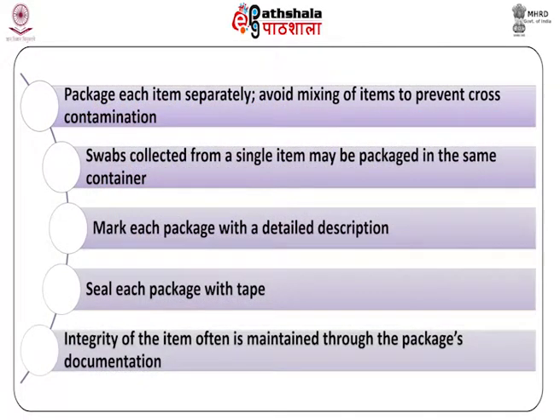Package each item separately. Avoid mixing of items to prevent cross-contamination. Swabs collected from a single item may be packaged in the same container. Mark each package with a detailed description that includes the item, location where it was collected, name of the person who collected it and the date of collection.